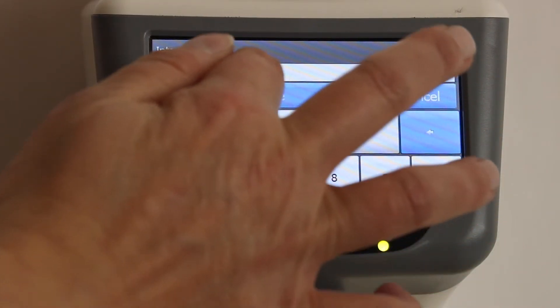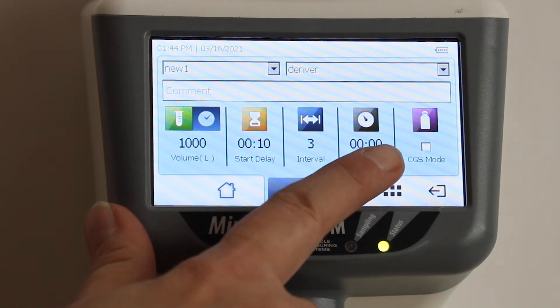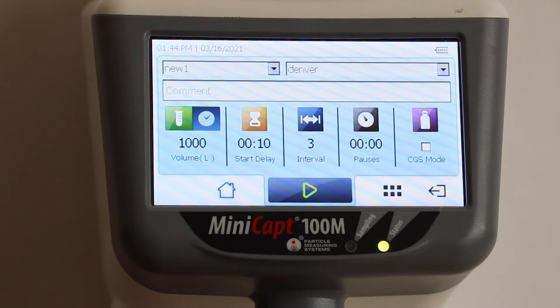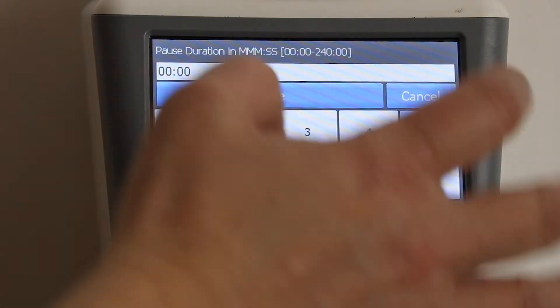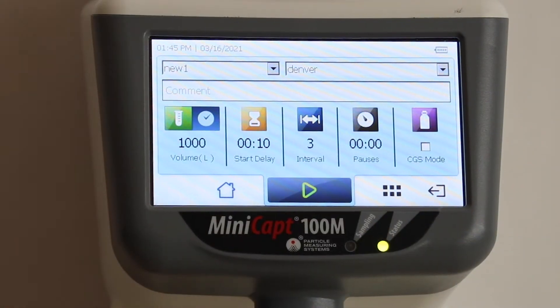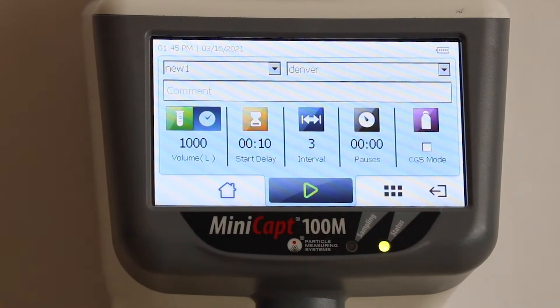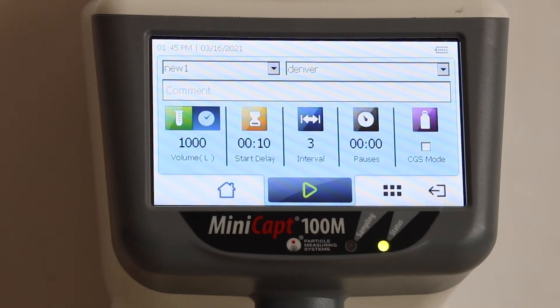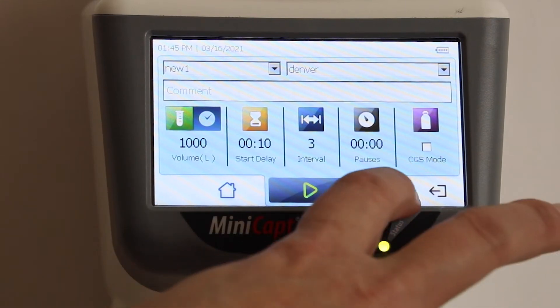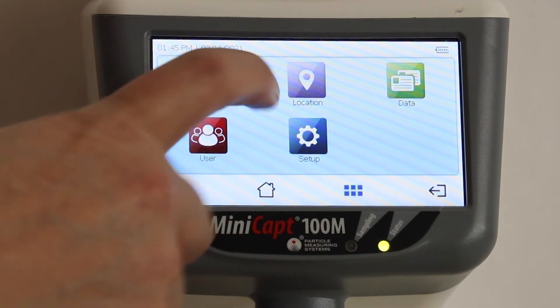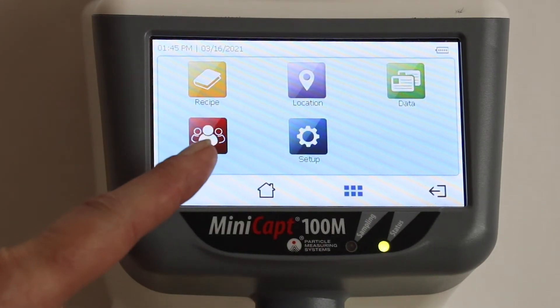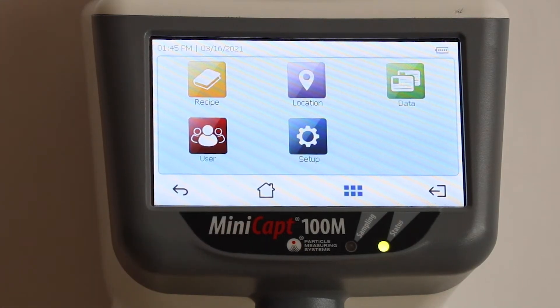You can set up as many intervals as you'd like — for example, three intervals within a thousand-liter sample. You also have pauses, so if you want to sample for 10 minutes and then stop, or if something happens and you need to pause your sampling and come back to it, that feature handles that. There's also a compressed gas mode: if you want to test compressed gas, simply attach the compressed gas kit, make sure that button is selected, and it's a straightforward process. The tools button lets you access different menus — recipes, locations, data, users, and additional setup.